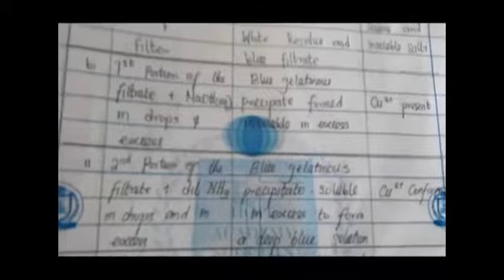Then to the first portion of our filtrate, we were asked to add sodium hydroxide in drops and in excess. Then we noticed a blue gelatinous precipitate formed when added in drops, and then in excess it was insoluble. Now we were asked to add in drops to find out the color change, and then in excess to find out the solubility of the sample.